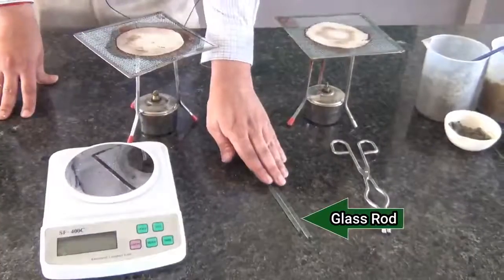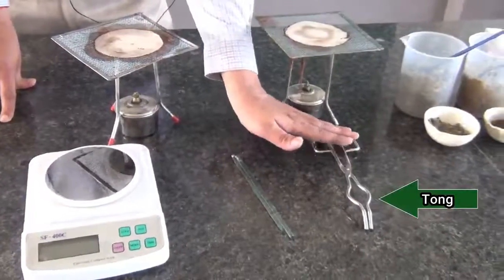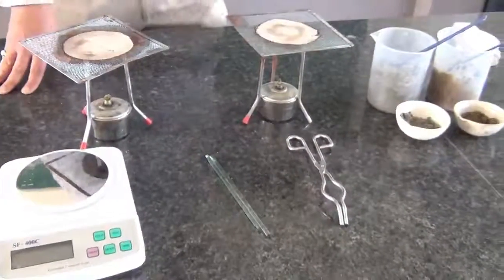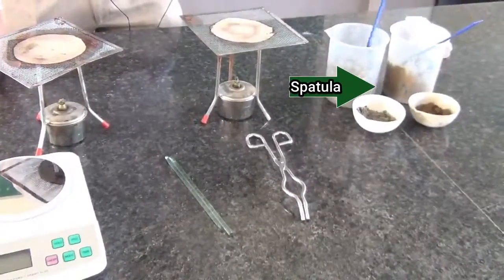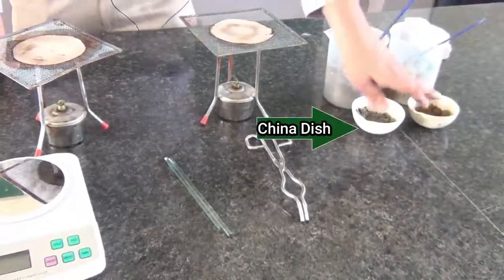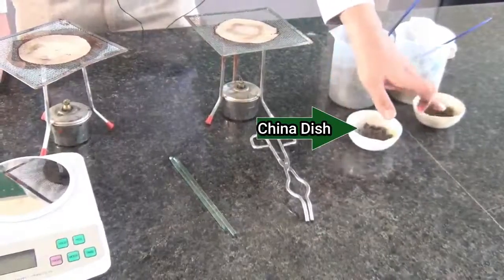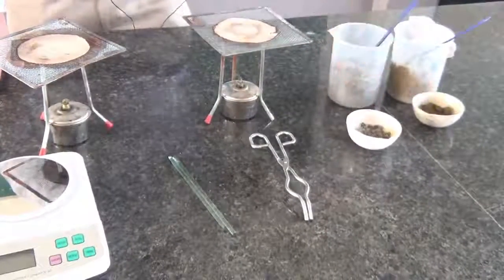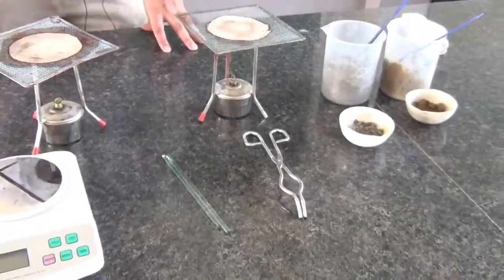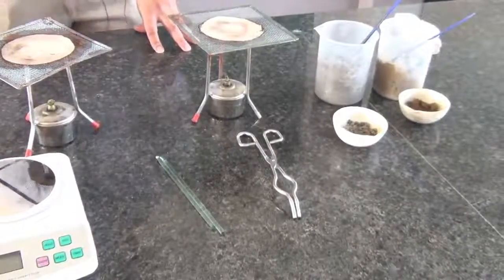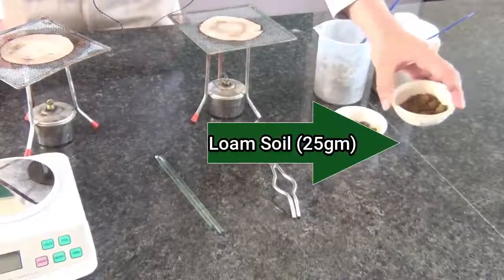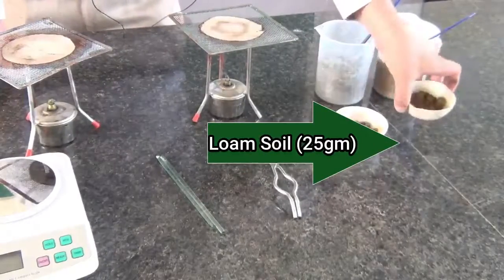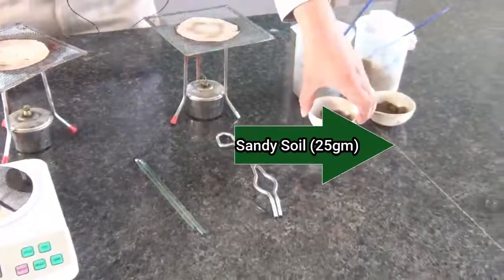Wire gauze, tripod, spirit lamp, glass rod, tongs. Then in this beaker soil samples are present. Naturally spatula is present. China dish is available and in that china dish 25 grams of soil has been kept. There are two soil samples. In this one the loamy soil is kept and in this one the sandy soil is kept.